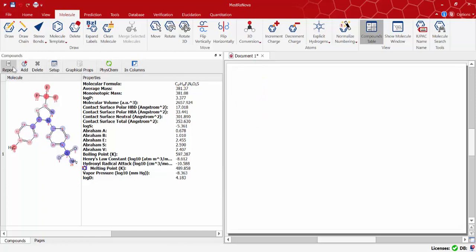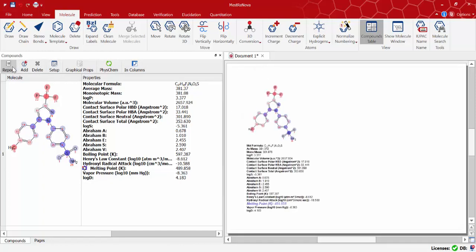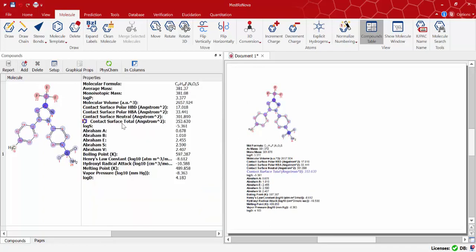We can also report these property values just by clicking the report button to see them all in MNOVA's main window. You can see highlighted in blue the property we want to report and its atom contribution or change it to the desired one as a kind of dynamic report.